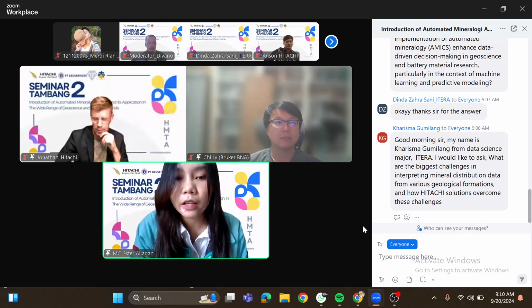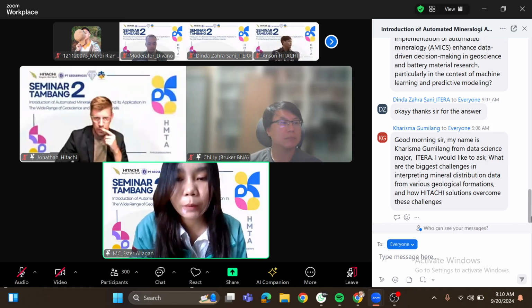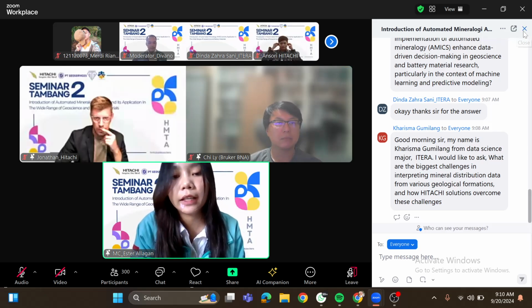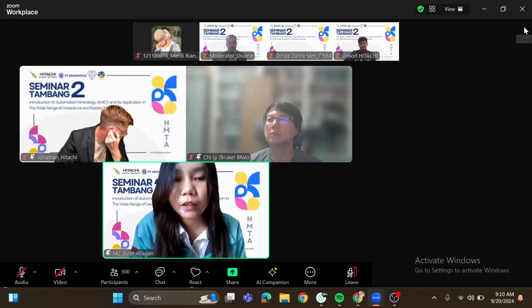In this first session, we know that AMICS, or Advanced Material Identification and Characterization System, is a fourth-generation automated mineralogy system jointly developed by Bruker Nano Analytics and Hitachi High-Tech Canada, with local support and development provided by a global partner.